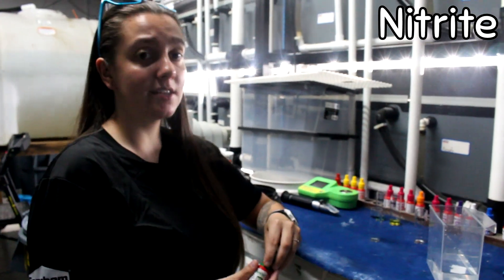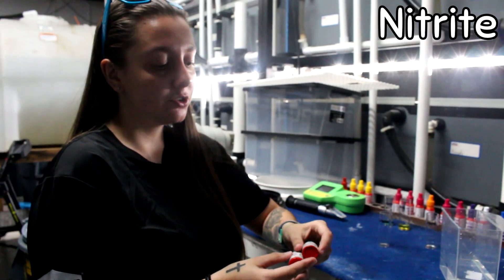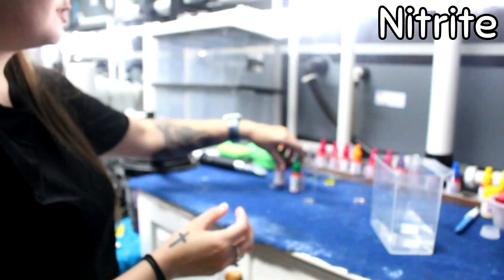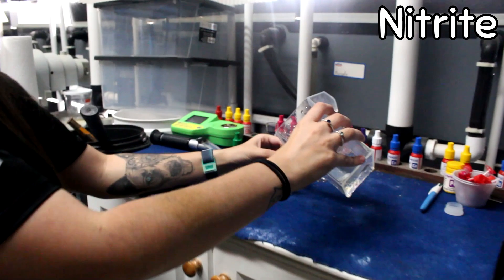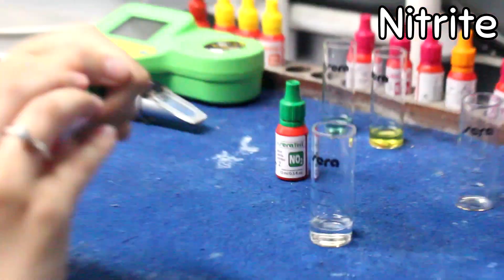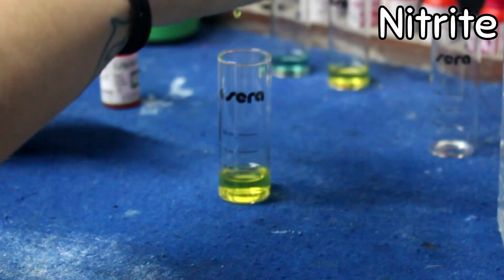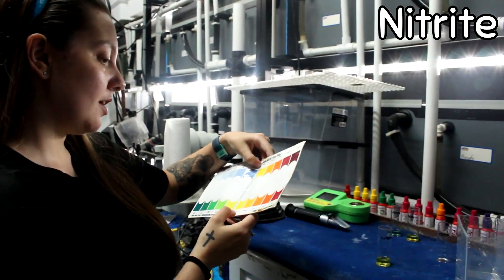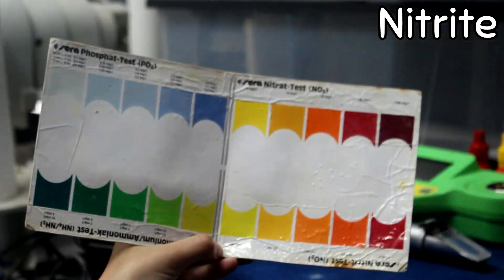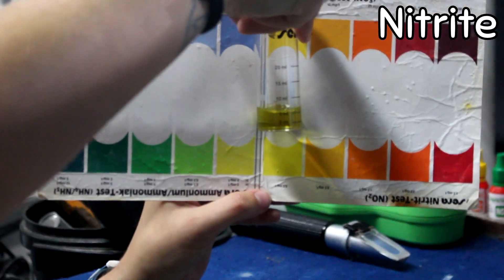Next up, we're going to test nitrite, which is also highly toxic — we don't want any of this in our tank either. This is a two-part test, so the bottles are labeled one and two. You're going to use five milliliters of water for both salt and fresh, and on the bottle it says to use five drops of each. The nitrite reading shows at the bottom of the vial. You want zero, so you want it to stay bright yellow. My nitrites are bright yellow, which means I have zero — exactly what I'm looking for.